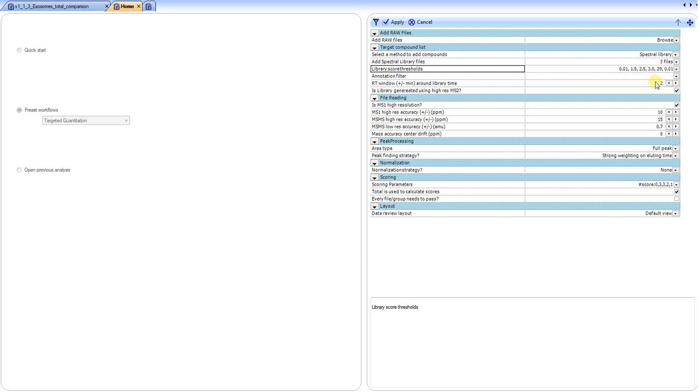These particular attributes of reading in the targeted compound list dramatically expedite the data processing, as well as simplifying the searching. The user does not have to pick and choose which proteins and peptides to do the quantitation on, nor does the user have to select a list of possible static or dynamic modifications. That's already been done during the initial search to create the spectral libraries. And again, this increases how fast the data processing happens.